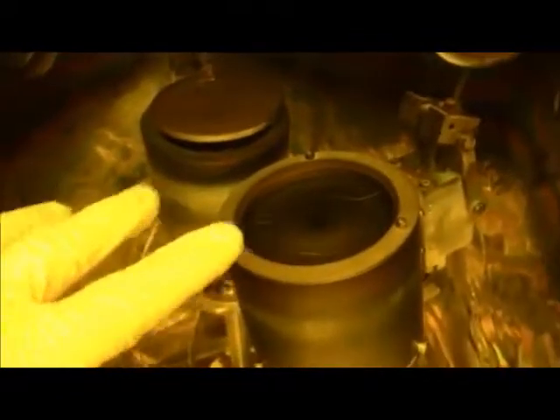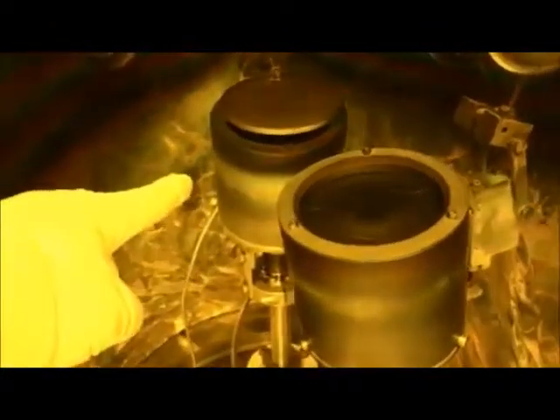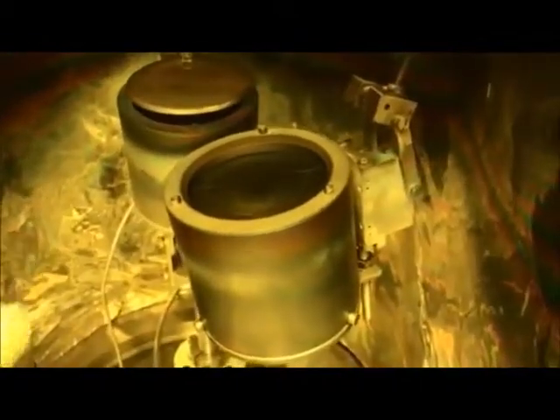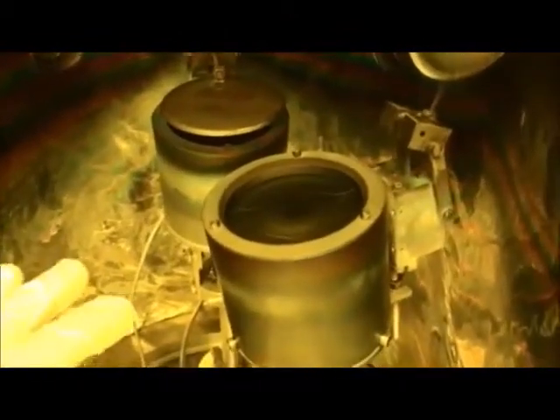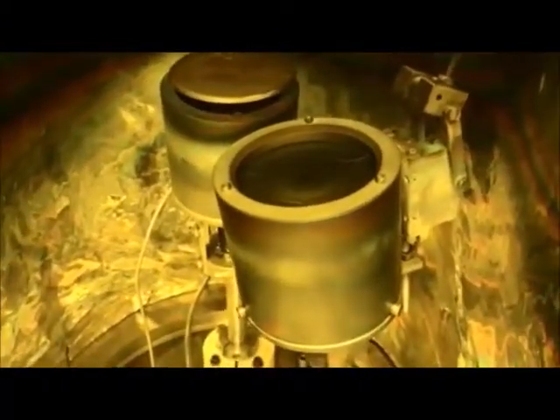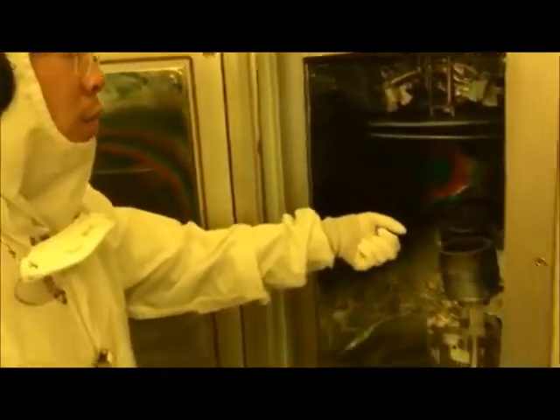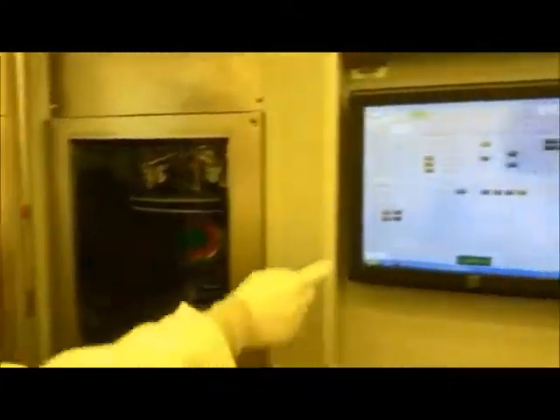Before you start, you might want to vacuum if there's some particle on top of the target. This is target 1, which is titanium dioxide, and this is target 2, silicon dioxide. Right after deposition, those targets may be very hot, so usually we won't clean it after our deposition. Usually we will vacuum it during the time you load your sample. When you vacuum it, try to avoid touching those areas with your vacuum hose, and make sure it's clean. If it's clean, then you can close the shutter back.